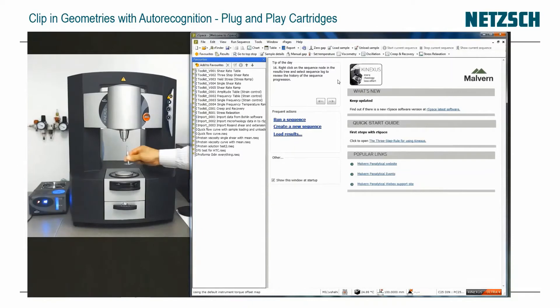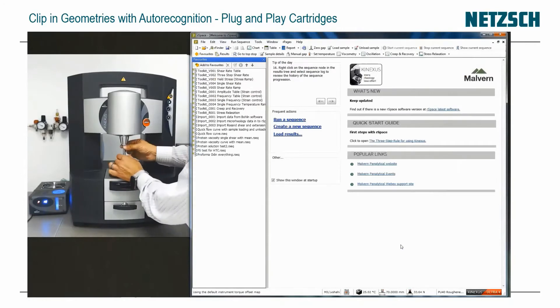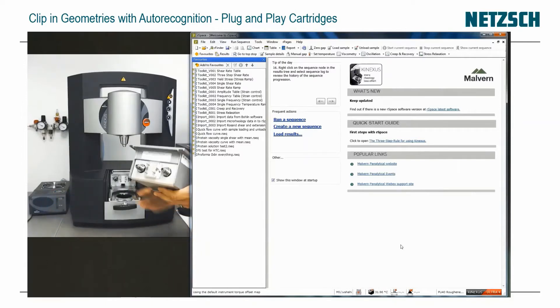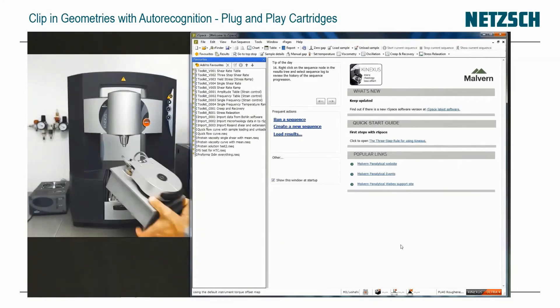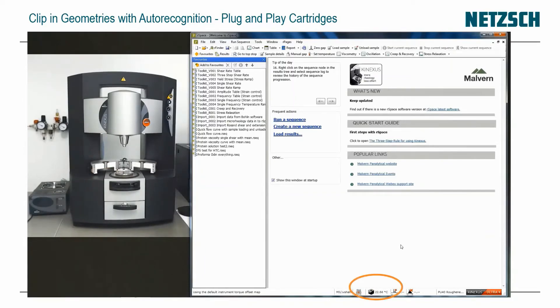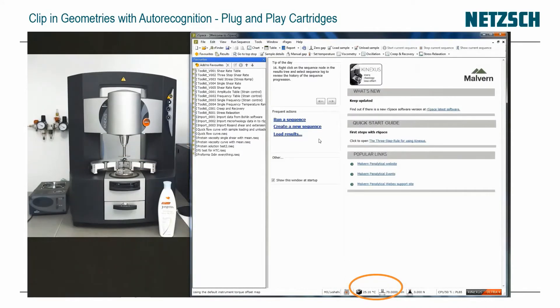I'm putting in a lower plate insert to turn my Peltier cylinder into a Peltier plate. It's recognized those geometries and is offering to zero the gap. I'll eject the whole cartridge to show the modularity. You can see the fluid connections on the back and electrical connections which hook up automatically — you just put the cartridge in, turn the handle, and it inserts accurately. The software auto-recognizes it and controls temperature accurately.